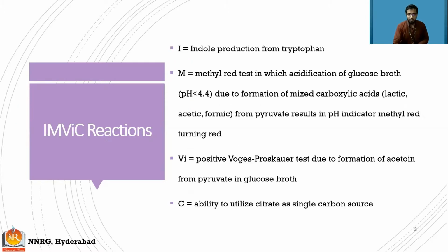So moving on with IMViC. IMViC, it is a combination of 4 tests. One is I, which is indole production test, M, methyl red test, VI, that is Voges-Proskauer test, and the fourth one, C, is citrate test. So we'll see what all these 4 are.